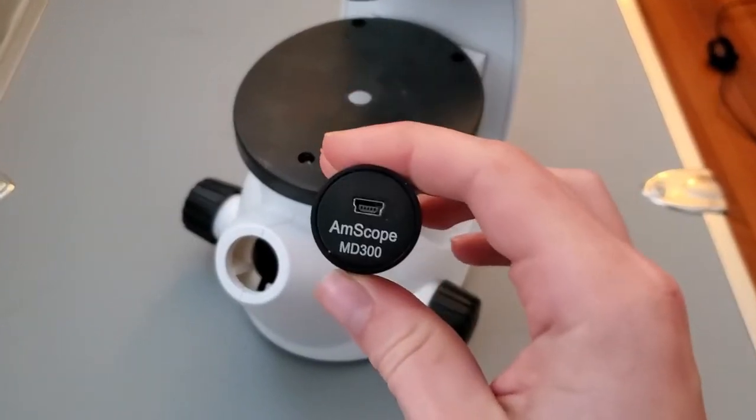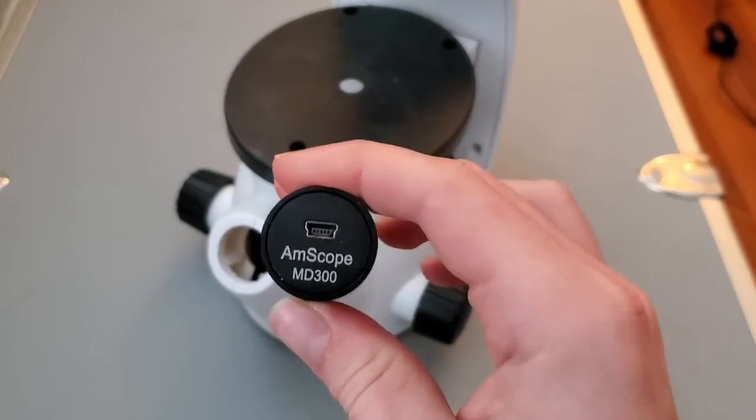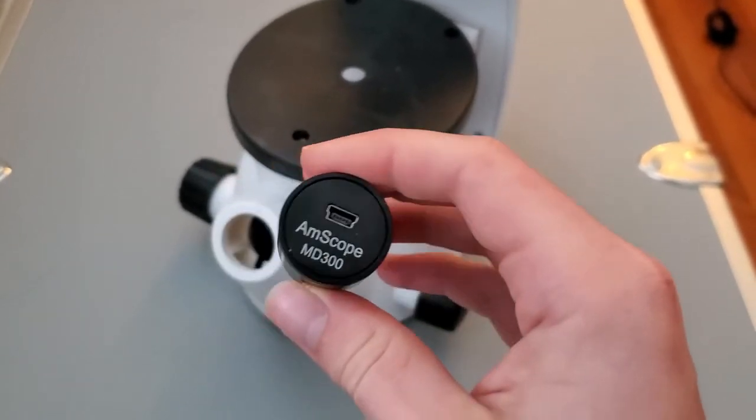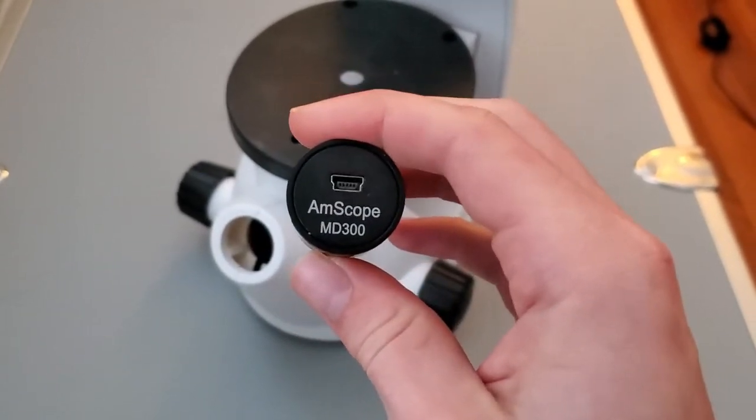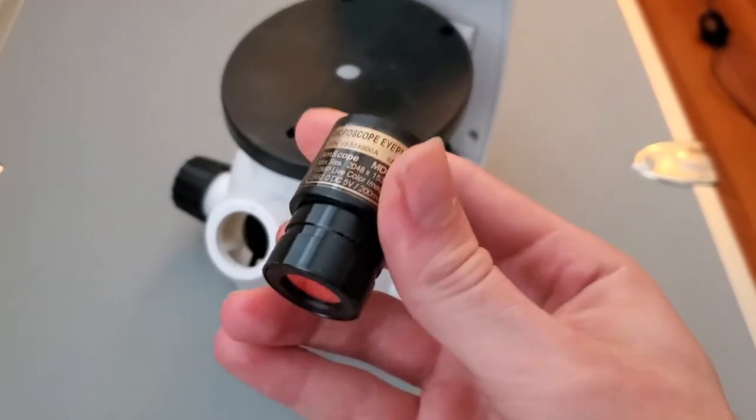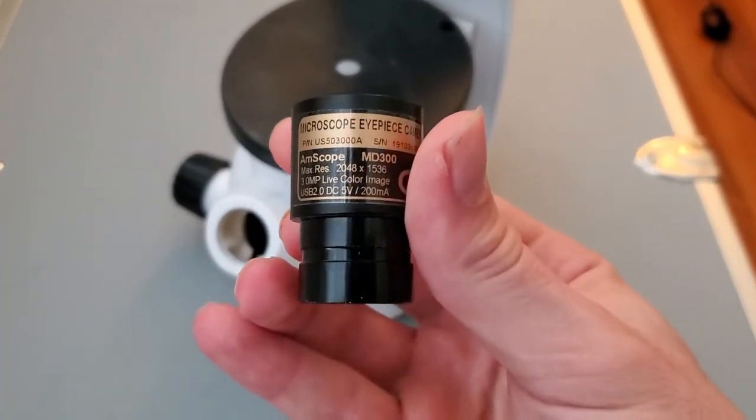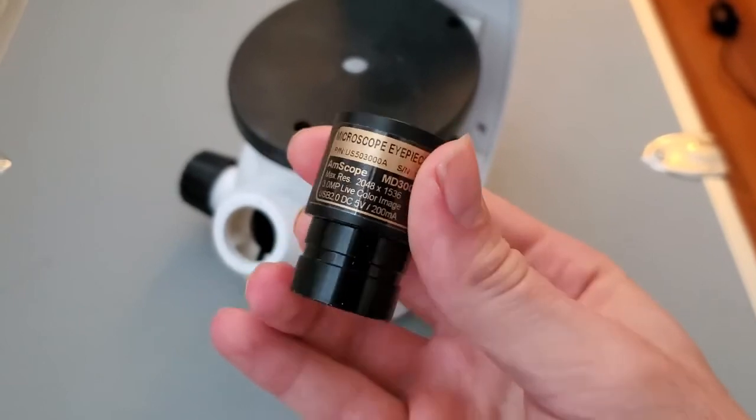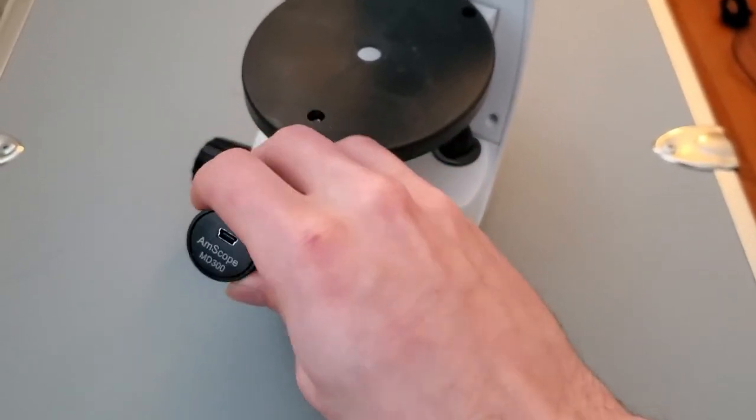It allows you to take images directly with a computer. If you get AmScope, they seem to be pretty good. This is just a three megapixel camera, but you can get decent enough pictures off it, at least for hobby use.